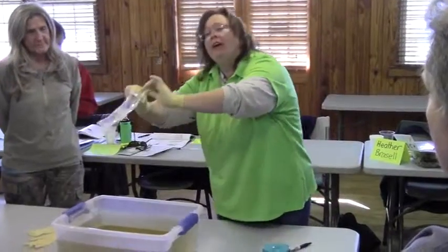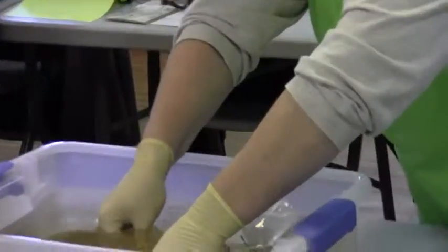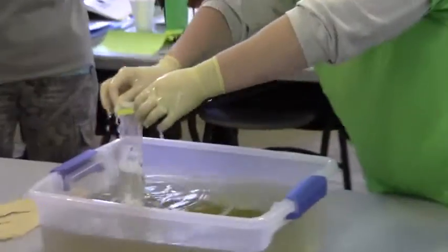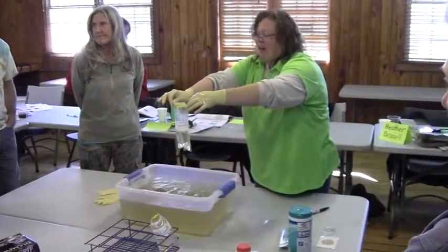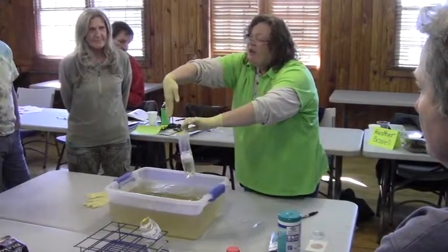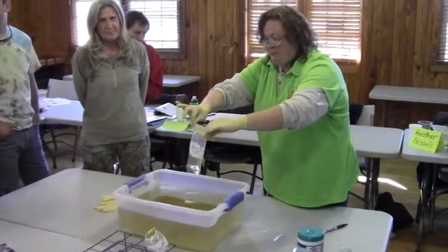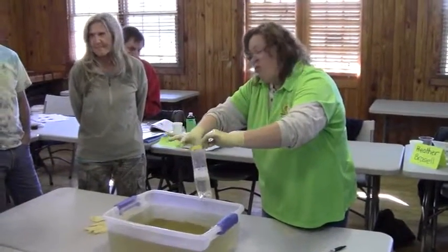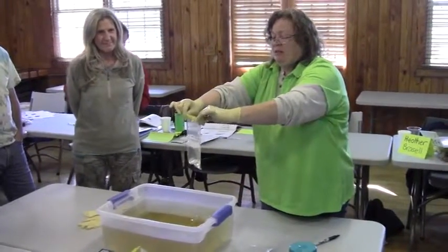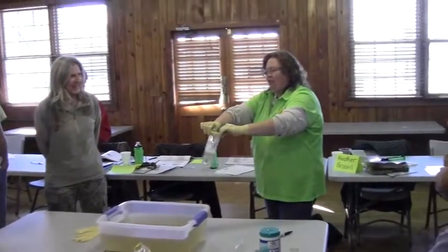Upstream, alright? I went to the top of my glove — not on the surface is the thing. You don't want to get the surface water. Okay, so we need to seal it. One, two, three.